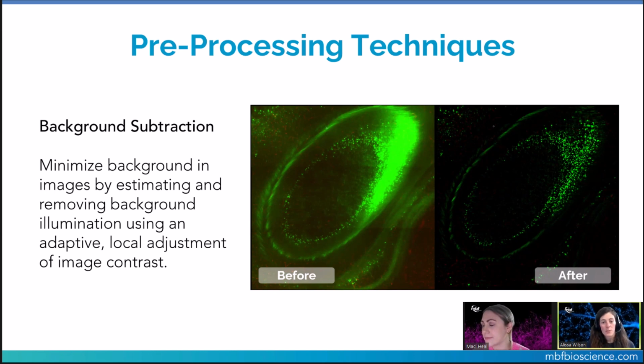And to do this, to begin, we offer some imaging processing features to set up your images for the most efficient reconstruction. The background subtraction filter will minimize the background in your images, bringing your objects of interest to the forefront and ready to reconstruct. This filter can be applied to a single stack or many using NL360's batch pipeline tool.